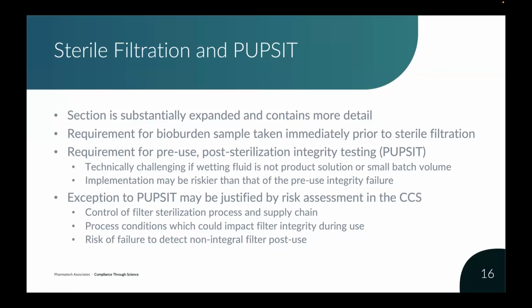So essentially we're talking about integrity being lost prior to the sterile filtration process, but then somehow on the post-use the integrity failure is not detected.